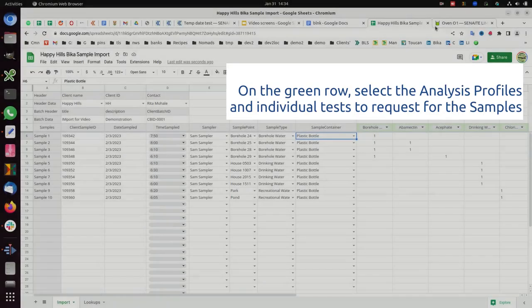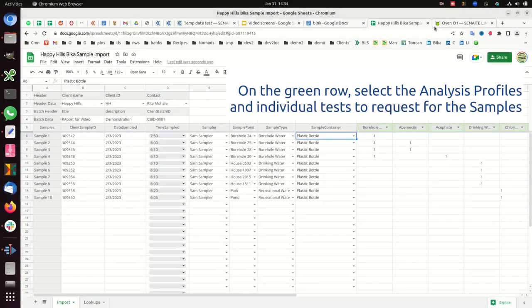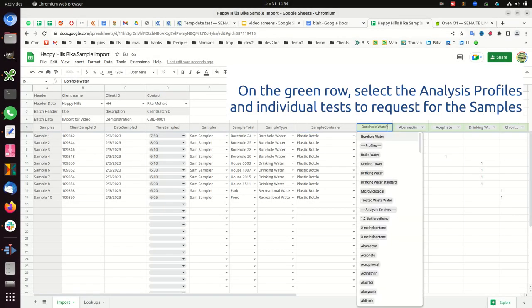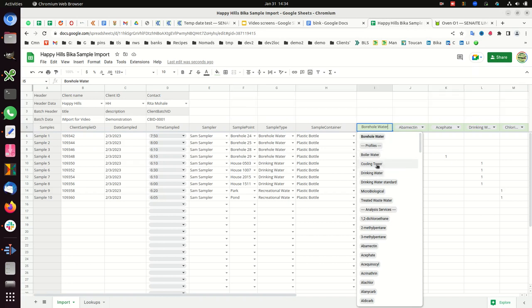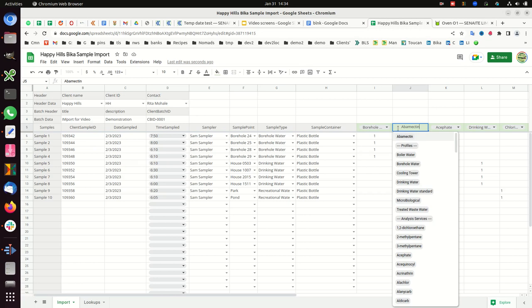On the green row, select the analysis profiles and individual tests requested for the samples. Repeat for all samples.